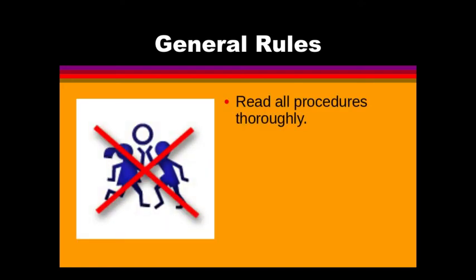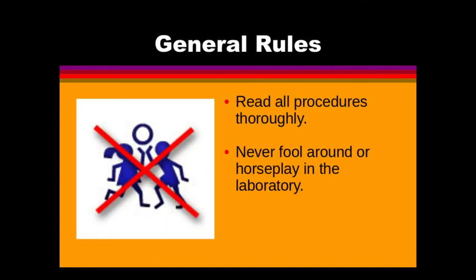All right, so let's look at a few more general rules. Read all procedures thoroughly. Here's my big one, and it's big because 7th graders have a problem with this sometimes. Never fool around or horseplay in the lab.